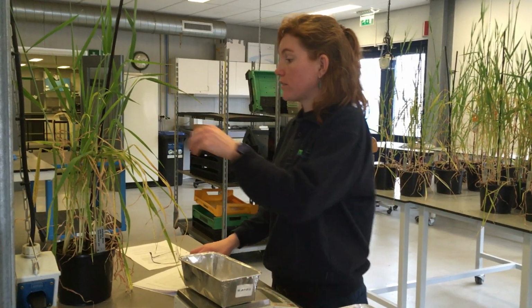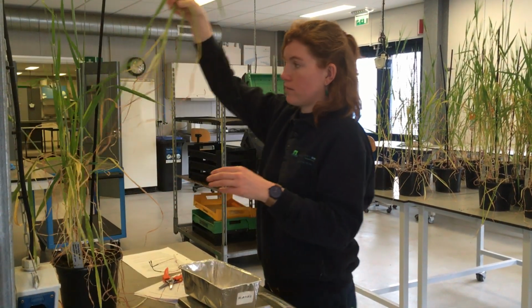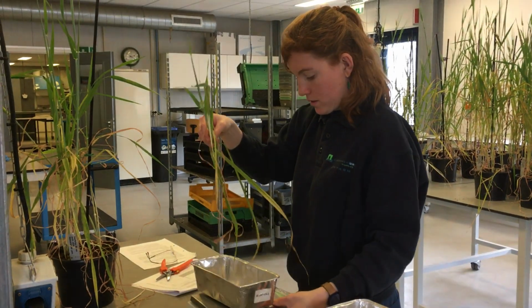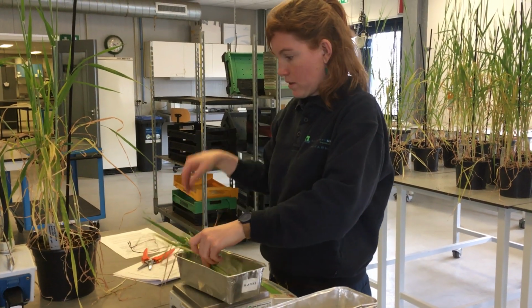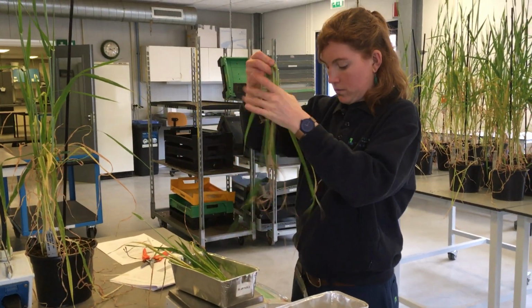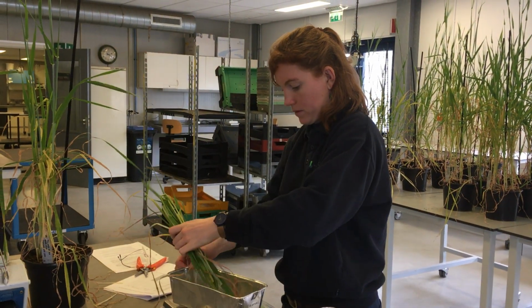Maybe you can just cut them. Shall I show how to do it? Yeah. Okay. You cut it just above the soil. If you cut it too high, then the fresh weight will be too little. I think you need to cut the 5 plants. We do not calculate individually, but we use the 5 plants' fresh weight as a total. Let's see, up to 0. There we go.